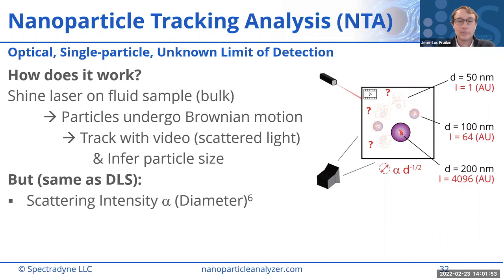I was wondering if you have ever measured polydisperse particles and compared your data from NCS1 versus TRPS. Oh yeah. So we have not done a direct comparison like that. I believe others in the literature have.